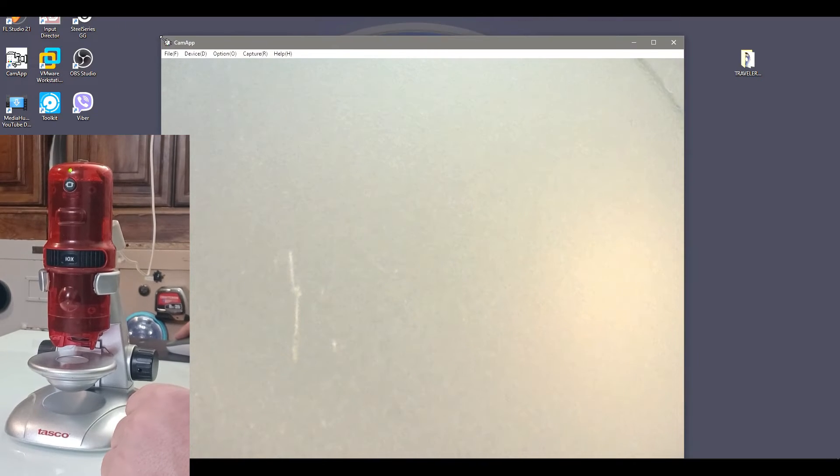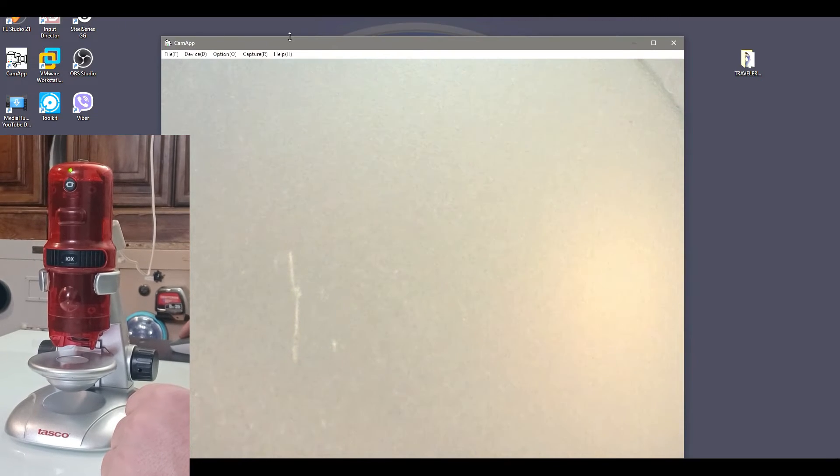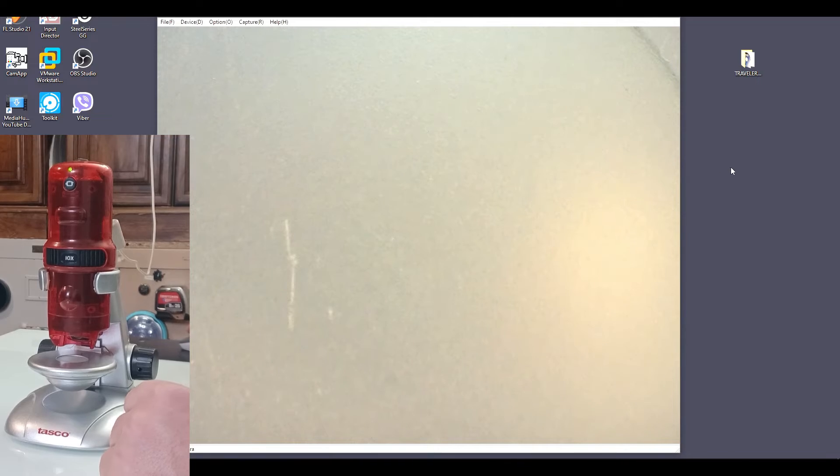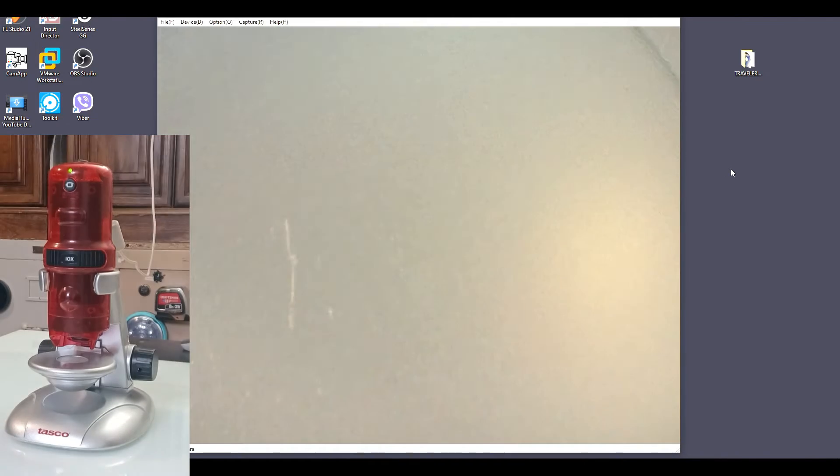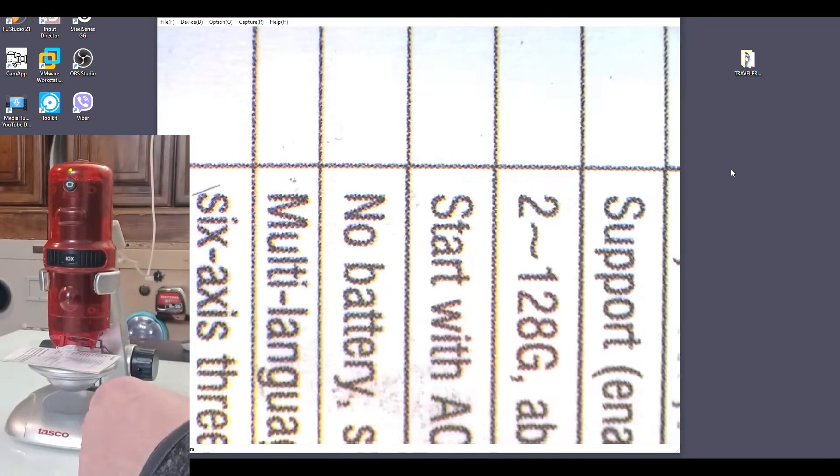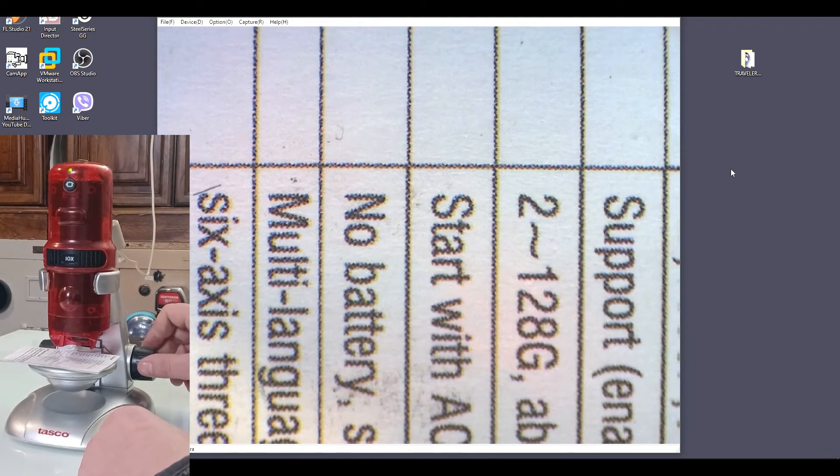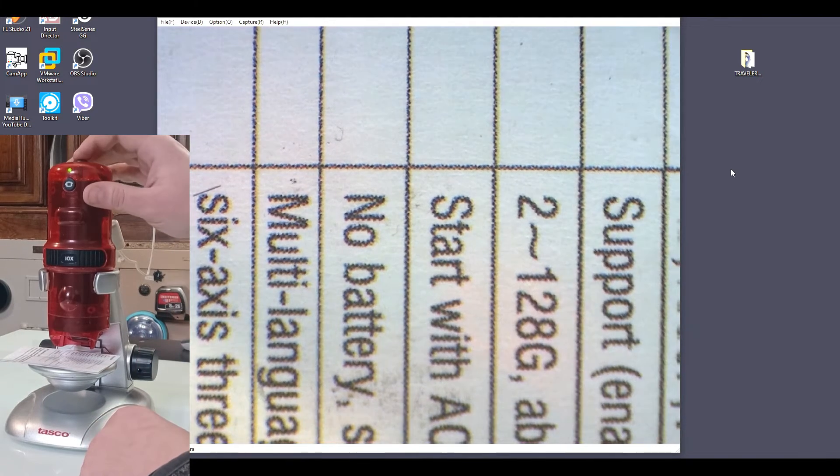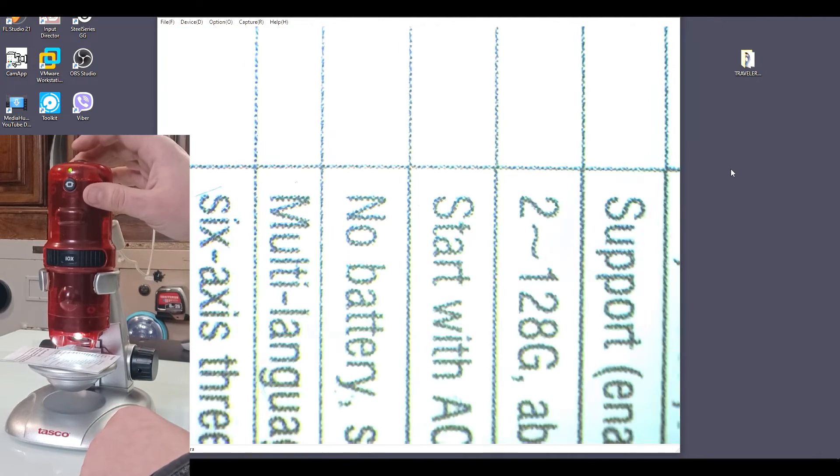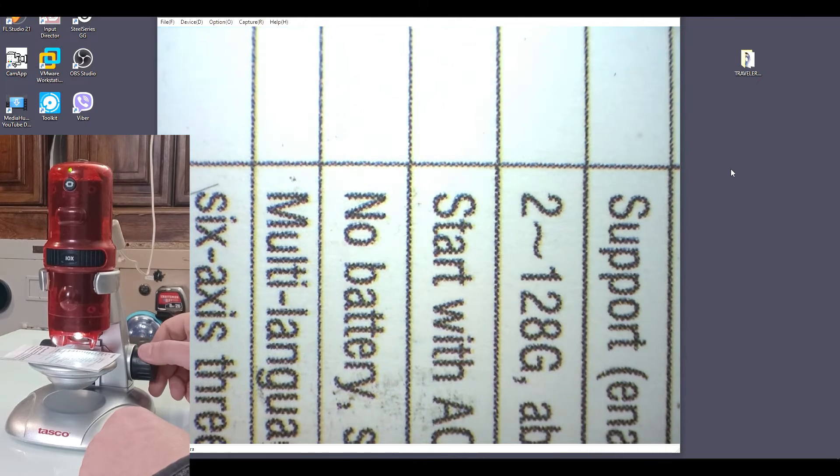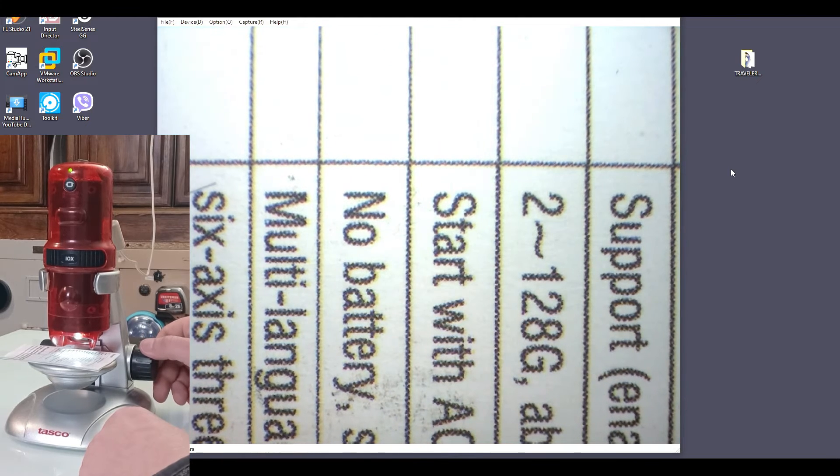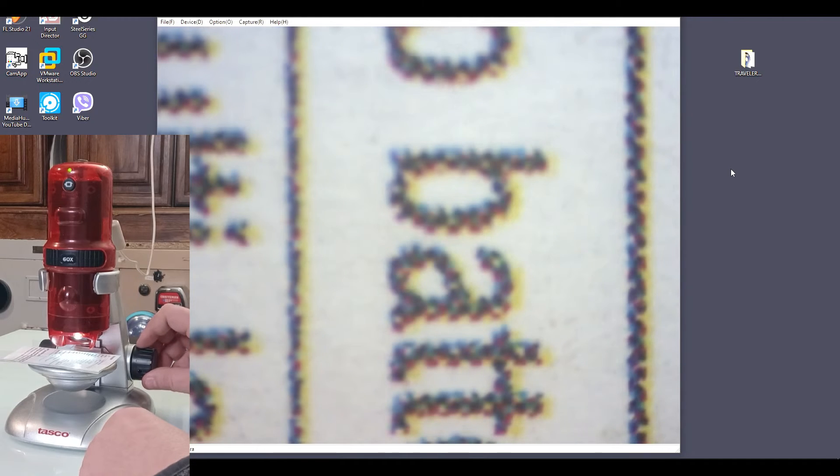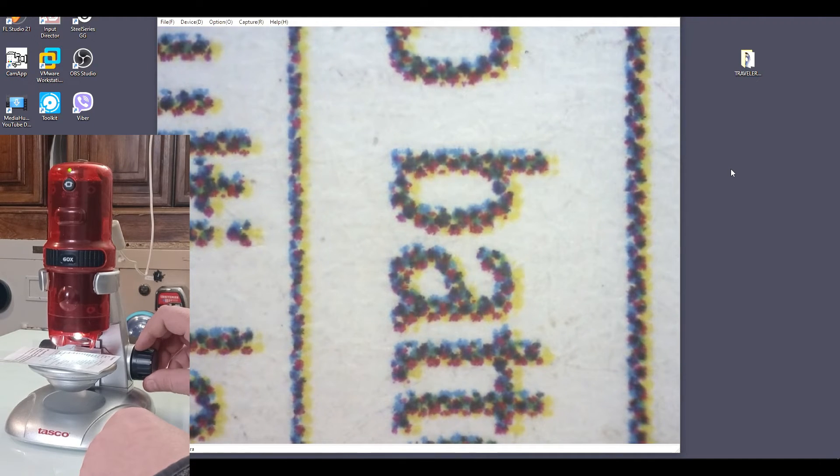Let me just make it a little bit smaller so you guys can see enough of it. Here is the microscope itself, the camera connected. Let me drop a paper. We are on 10x right now. As you see, this is what the camera sees. The light here, you can turn the light on as you see, it works. You can make it clear or not. Let me go to 60x so we actually see the grain here. Let me make it clear.